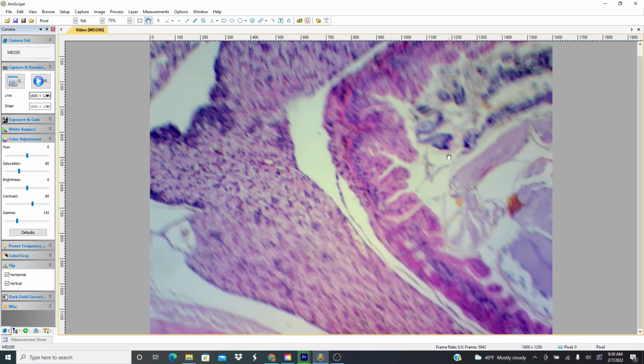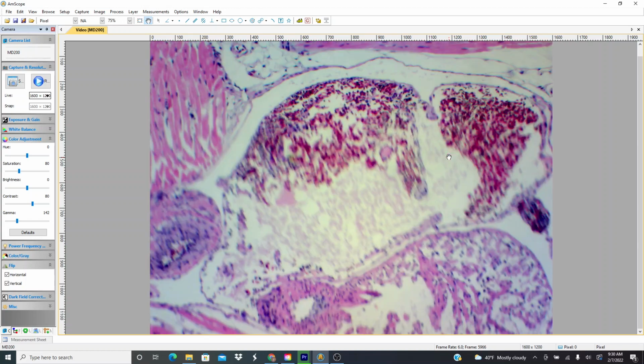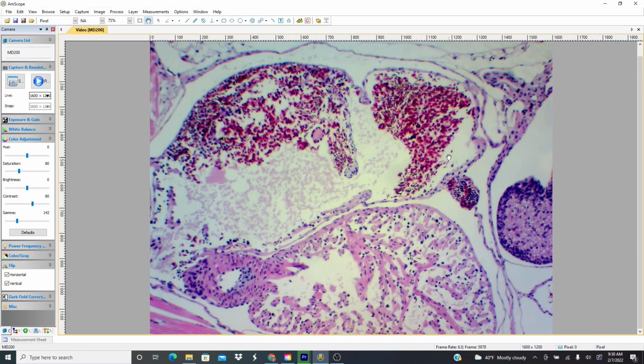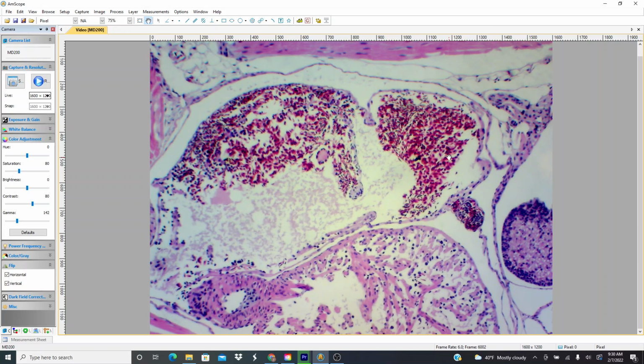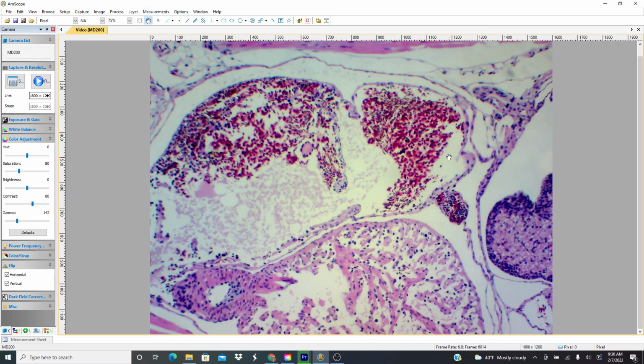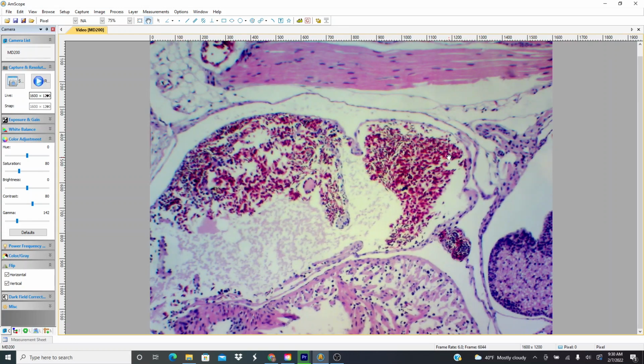So kind of going down, going from the head this way. This was the heart here. I mean, I don't know. Obviously amphibians breathe air, so they must have lungs, but this thing that contains all these red blood cells doesn't look like a lung to me.